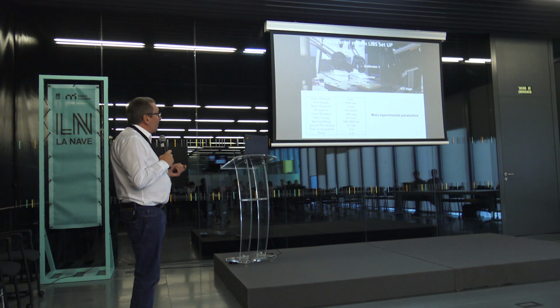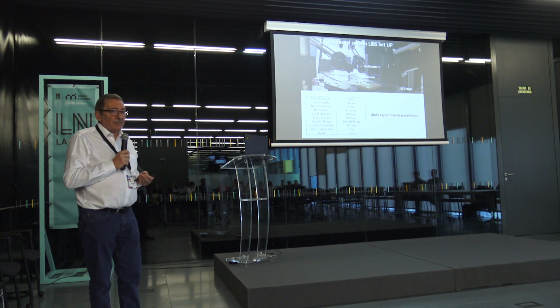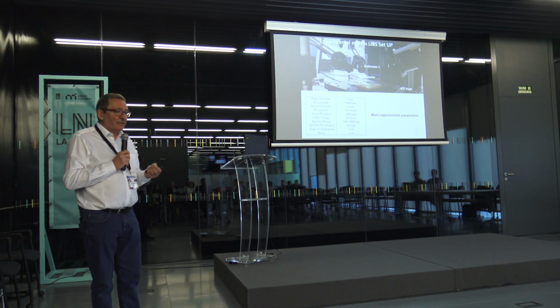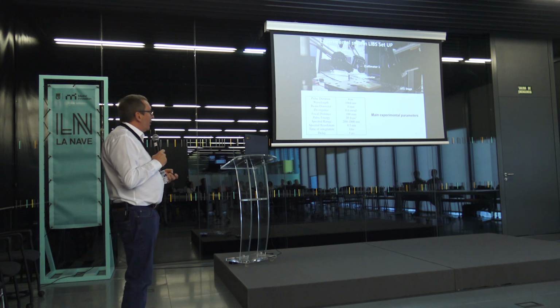The experimental setup is a typical LIBS setup, laser-induced breakdown spectroscopy, an analytical technique to obtain information about the sample.